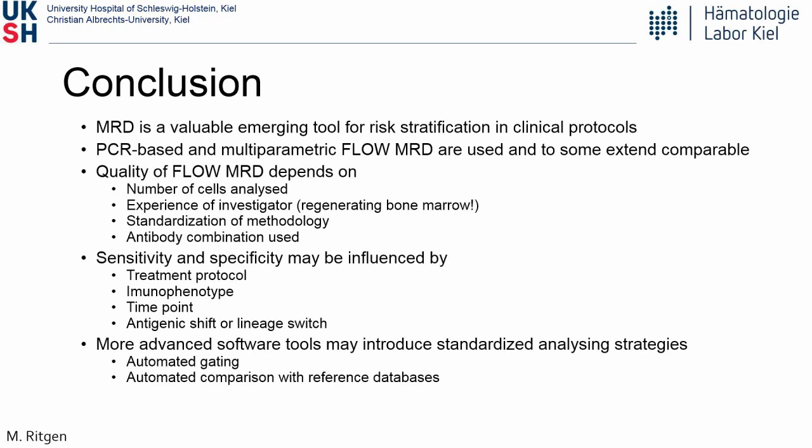Yeah. CD22 might be one option, CD24 maybe, and others are discussed, but I think we do not have enough information on stability during the treatment and on the influence of CD19-targeted treatment on the other markers. So we need, I think, at least a few months' time to assess this in more detail. Great.